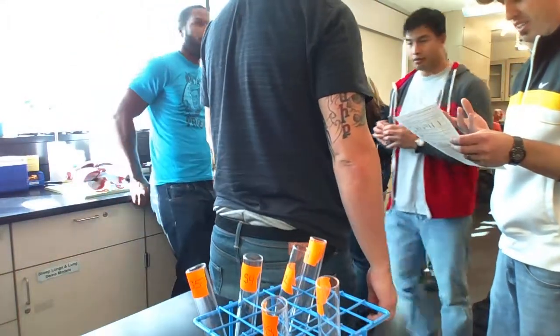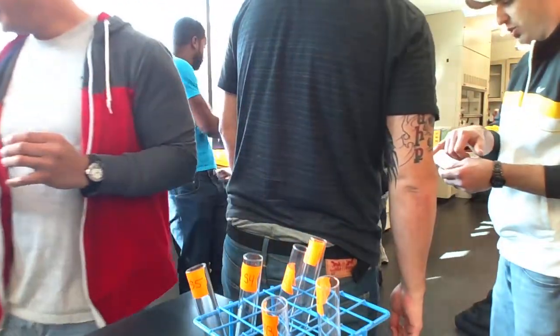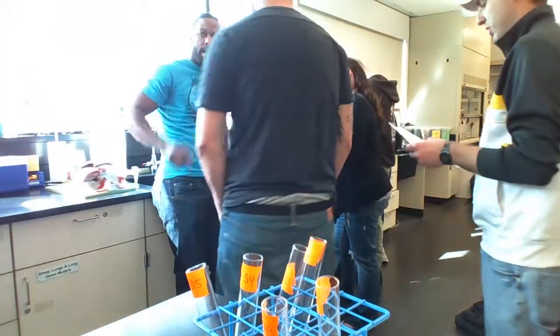Or we can do water. 5 drops of water for 2. Just litmus cream goes along with everything.